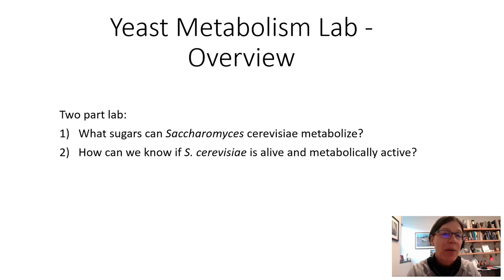And the second part of the lab was asking the question, how can we use the methylene blue viability assay to determine if Saccharomyces cerevisiae are alive and metabolically active?